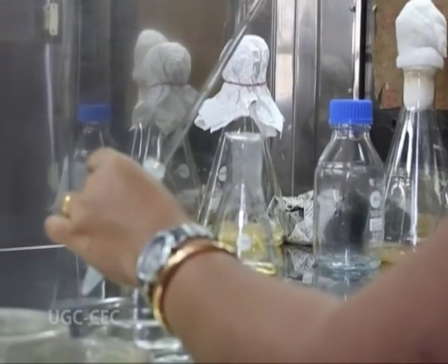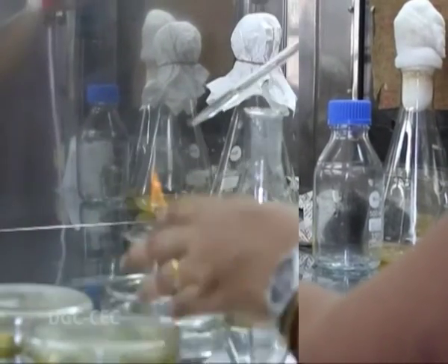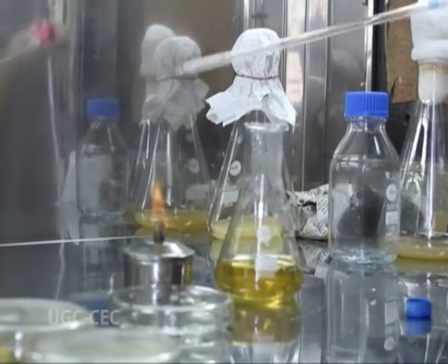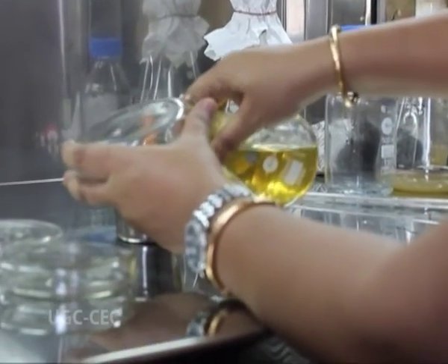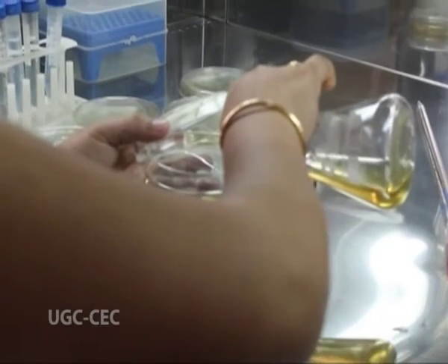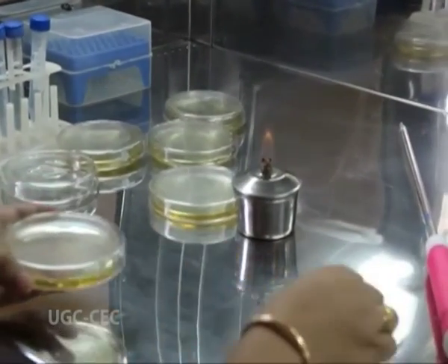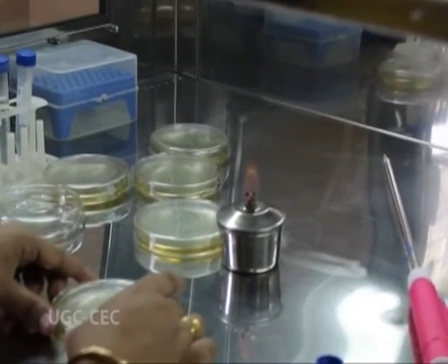Then 1 ml of the bacterial suspension is transferred to the labeled petri plate. Then the lid of the petri plate is slightly lifted with the left hand and the sterile molten agar is poured on the plates. Then the dish is rotated gently to mix the culture and the medium thoroughly and to ensure that the medium covers the plate evenly.